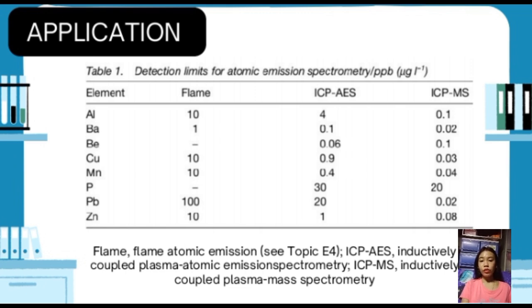In terms of ICP-MS, or inductively coupled plasma mass spectrometry, it represents a more advanced form of ICP that provides not only elemental composition but also isotopic information. An ideal real-life scenario for students would be its application in forensic science.